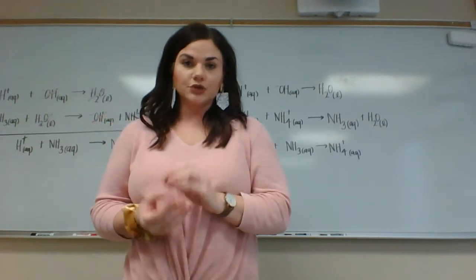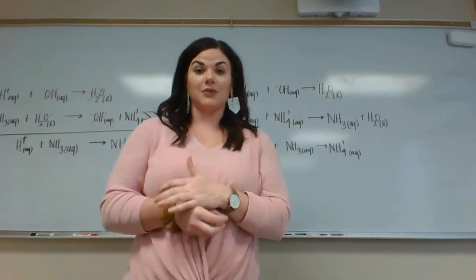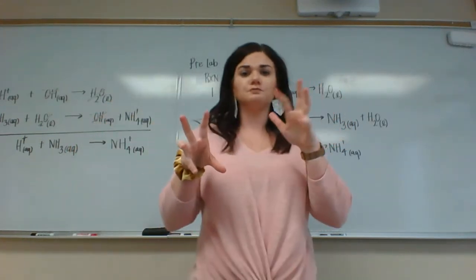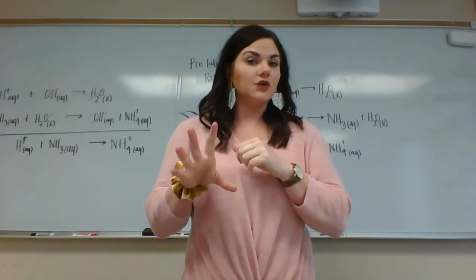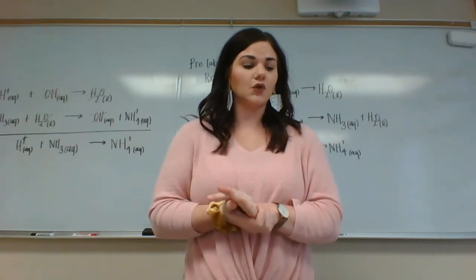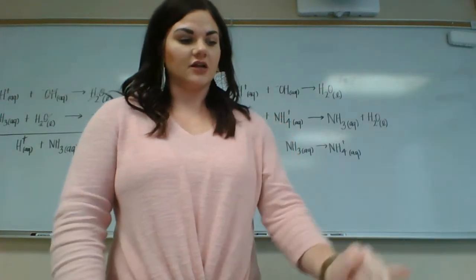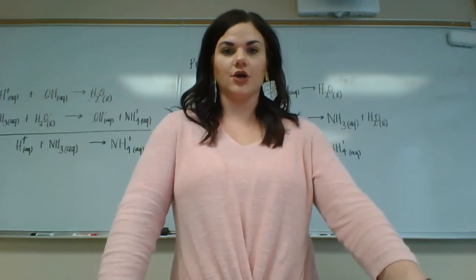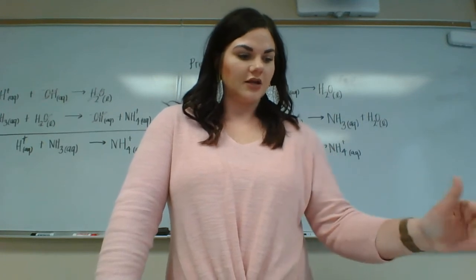So the actual procedure, not difficult. You are taking a coffee cup, you're going to put it in a beaker, and then you're just going to measure the solution's initial temperature and then the temperature when you mix 2 solutions together, you get that final temperature. So there's a few things I'll tell you about in the procedure, and then we'll strictly talk about the math. If you look at the procedure, on the back of the first page, it says part 1. Number 3 says nest a styrofoam cup in a beaker. Those styrofoam cups fit best in a 250 ml beaker. So just make note of that.